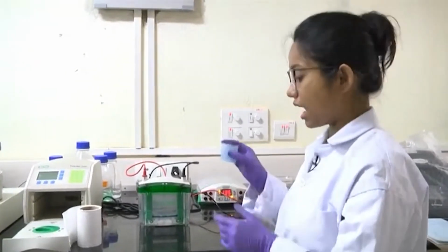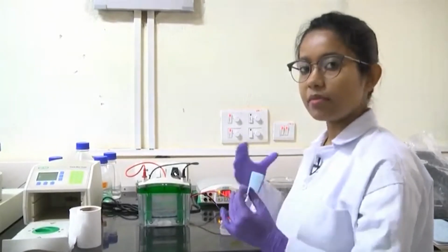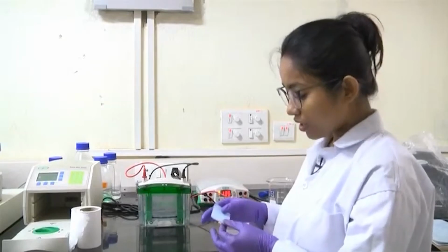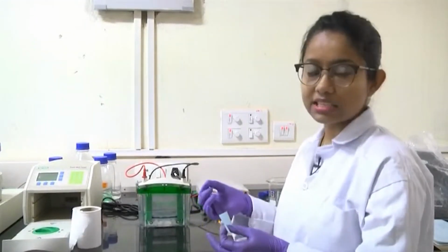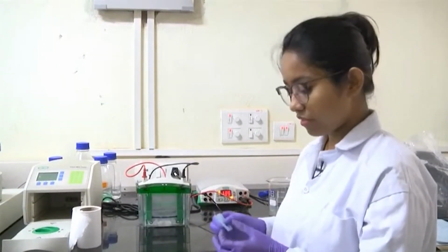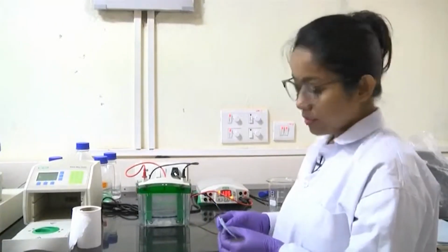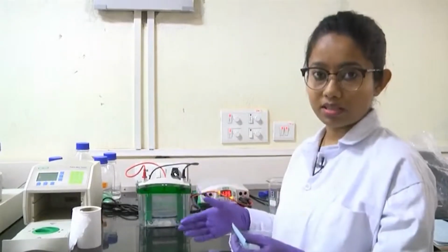cut a very small size. This membrane comes as a roll, and also in a pre-cut version, and depending on how much you need, basically I will need only 2-3 lanes. So depending on the measurement of the gel where my protein will be, I will cut a small piece of membrane from the roll. Because membrane is very expensive, do not waste the membrane, do not cut the full membrane as a whole.